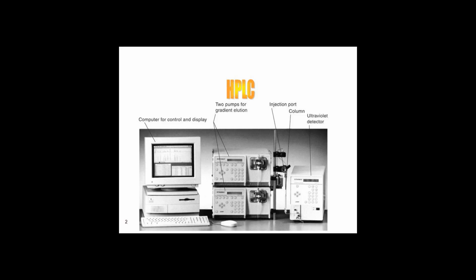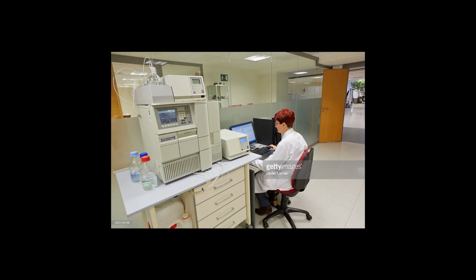Aqueous normal phase chromatography. Aqueous normal phase chromatography, ANP, is a chromatographic technique which encompasses the mobile phase region between reversed phase chromatography, RP, and organic normal phase chromatography, ONP. This technique is used to achieve unique selectivity for hydrophilic compounds, showing normal phase elution using reverse phase solvents.